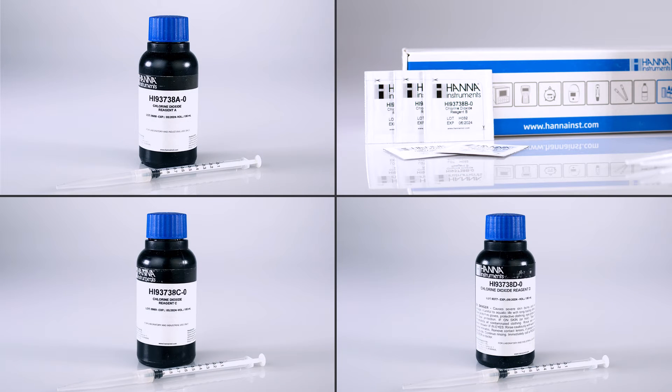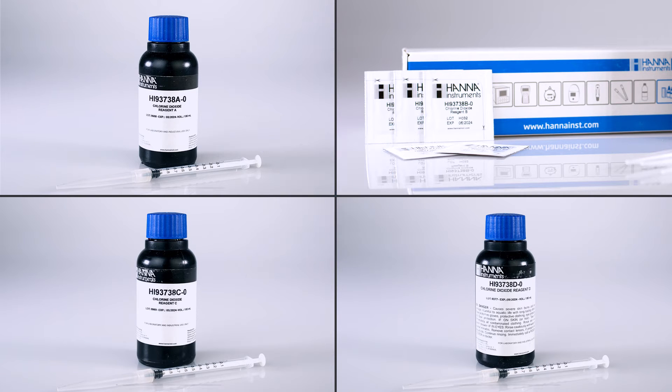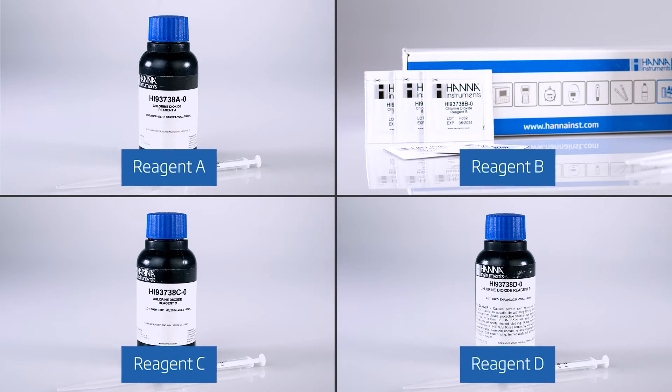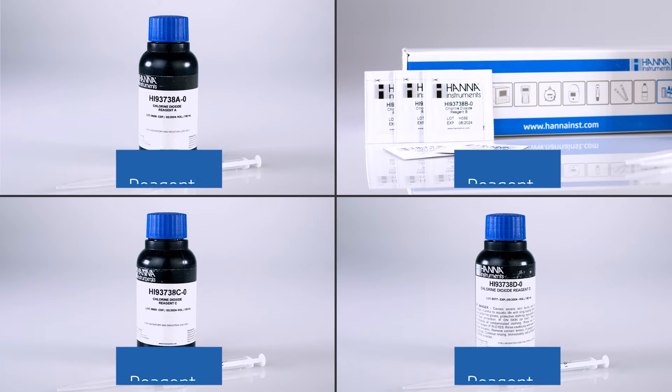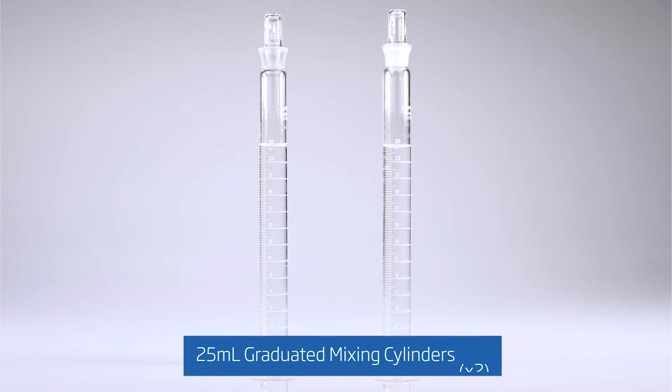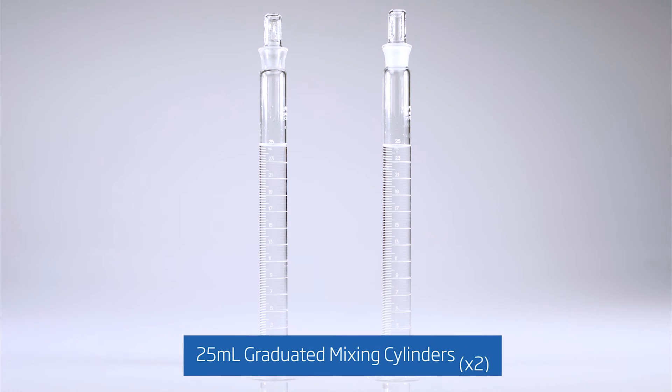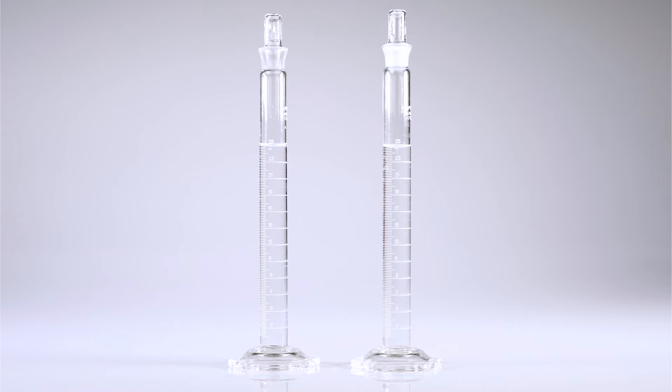Required reagents are sold separately under one of two product numbers: HI-93738-01 for 100 tests, and HI-93738-03 for 300 tests. These packs include reagents A through D along with the necessary syringes for proper measurement. In addition, you will need to obtain two 25 milliliter or larger graduated mixing cylinders with caps from your trusted labware provider.